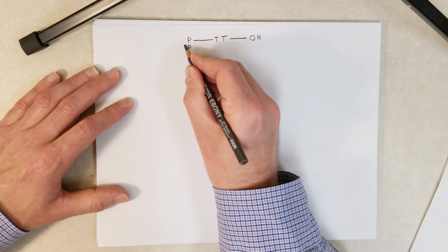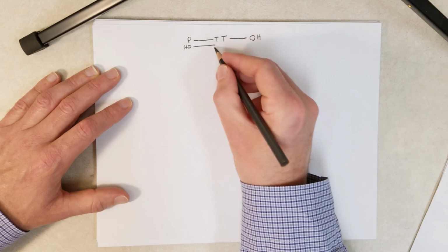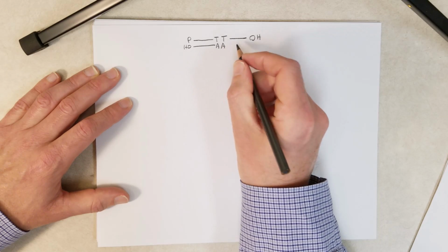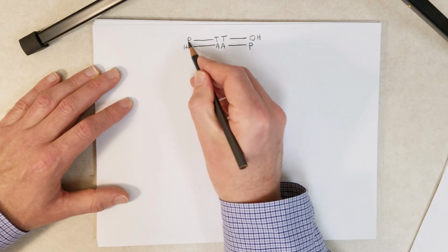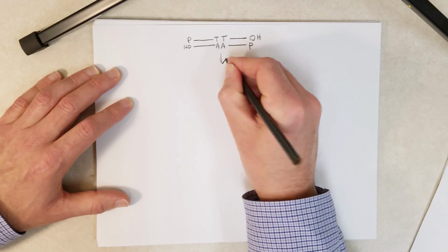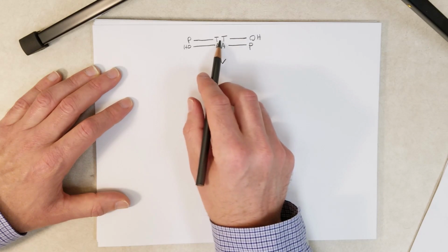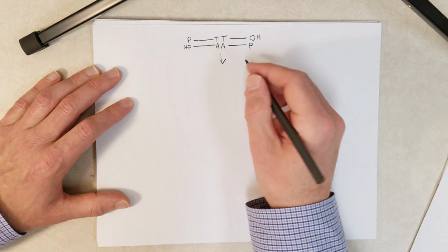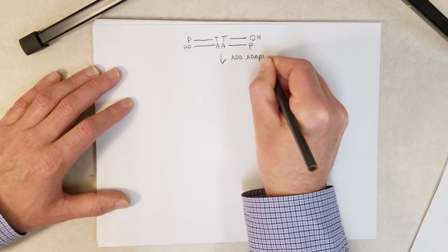So now this OH represents the 3' OH of a nucleotide at the 3' end. And the P represents the 5' phosphate group on the 5' end. So the next step, after we have all these fragments from across the genome, some of them are going to have CPDs, some won't, is we're going to add these things called adapters.